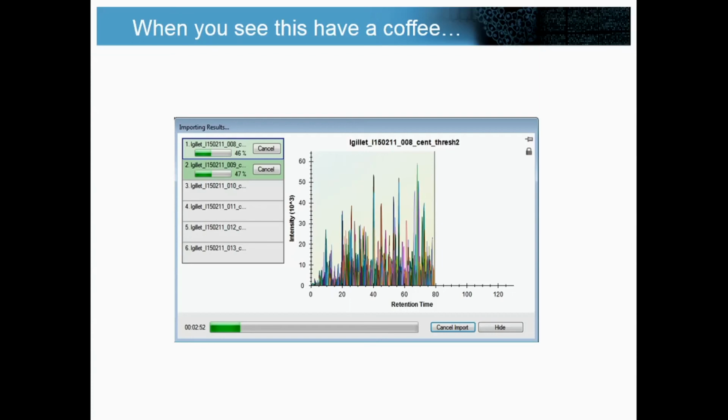Okay, so I would suggest you try to get to this in the next 20 or 30 minutes, then take a break, and then we can come back and finish up. So good luck.